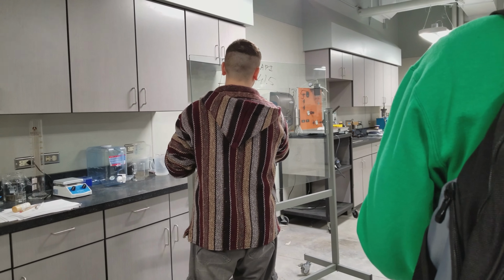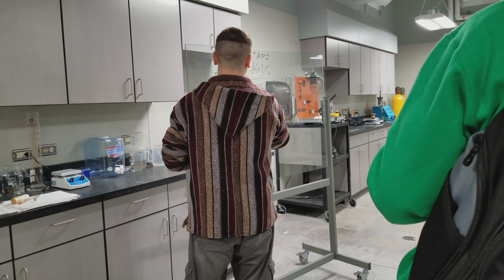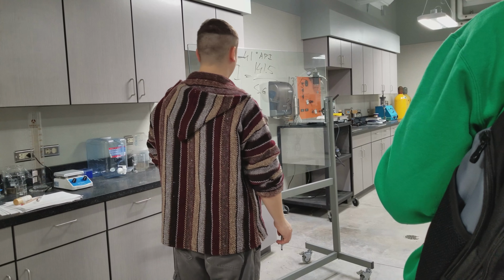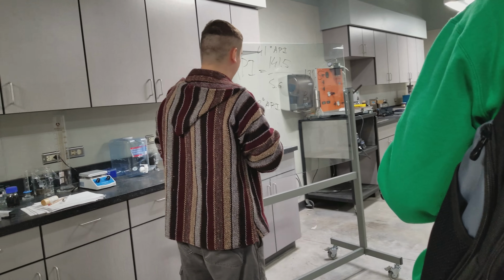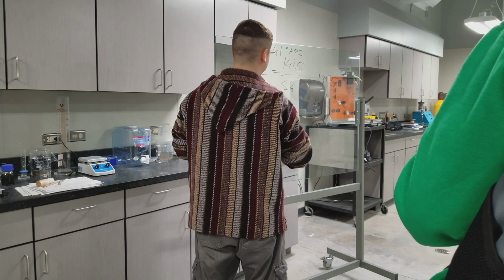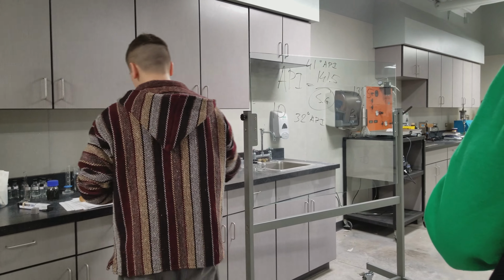It is 32 degrees API, heavy crude. It also has sulfur, which makes it lower quality, not suitable for all refineries and stuff. Anyways, to get API gravity, which is a calculation of this equation, you need to measure SG. And this is the simplest experiment in this lab.